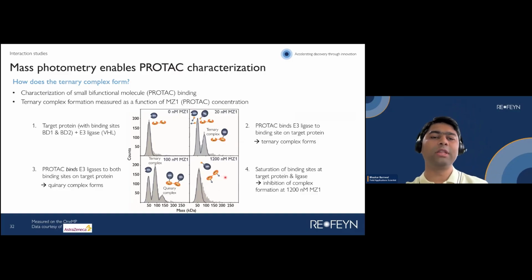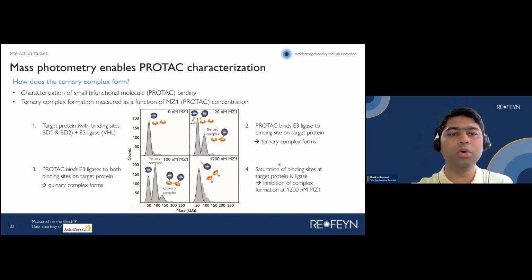So if you have any small molecules which can bring upon any structural changes, and it is bigger than 30 kilodalton, you can always study that using mass photometry indirectly. Whether it is glue or a small molecule inhibitor or a PROTAC-like molecule.